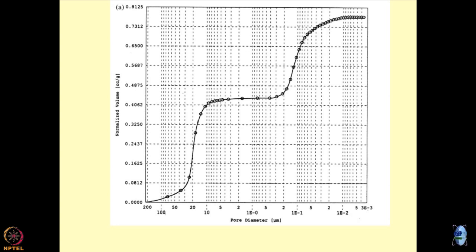Now, this is where you have to really go for the microscopic examination of the types of pores which are present in the system. And you never know, this could be dead end pores, this could be surficial pores, because even if you are applying pressure, the volume is not increasing. So, the interpretation could be different.